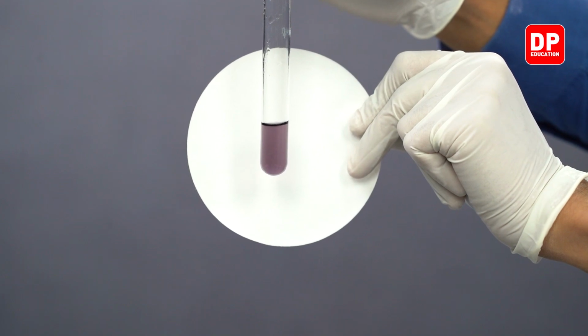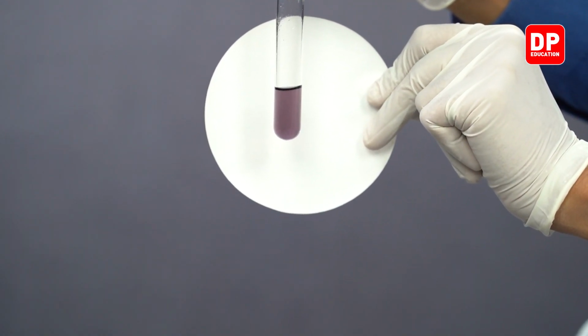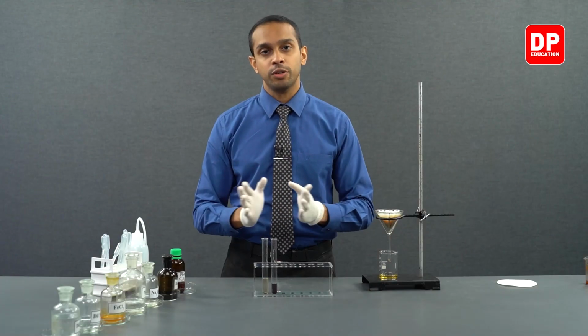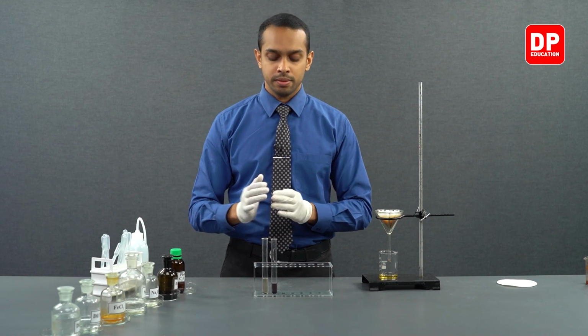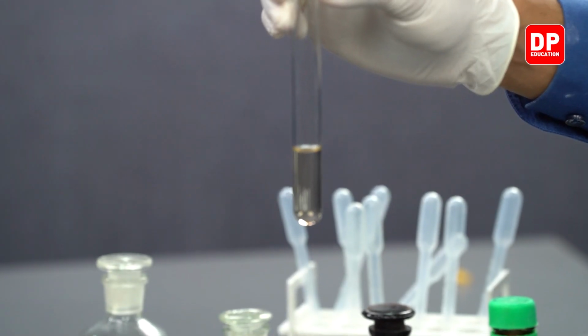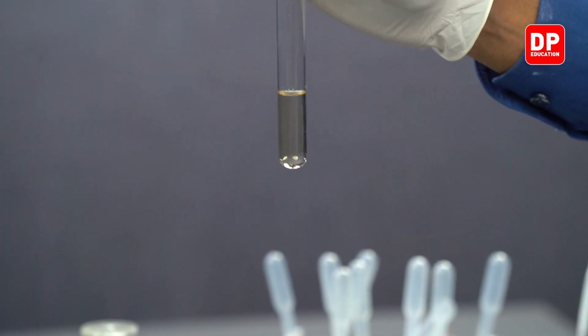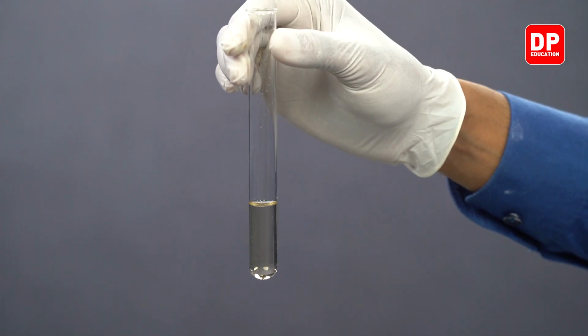This is due to Fe3+ ions forming a complex with phenoxide anions. Upon addition of hydrochloric acid to the purple color solution we had, we were able to decolorize the purple color and obtain the color of ferric chloride that we observed earlier.